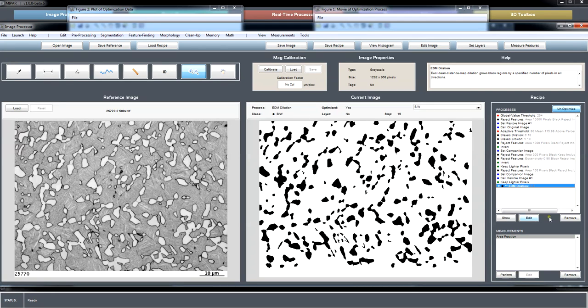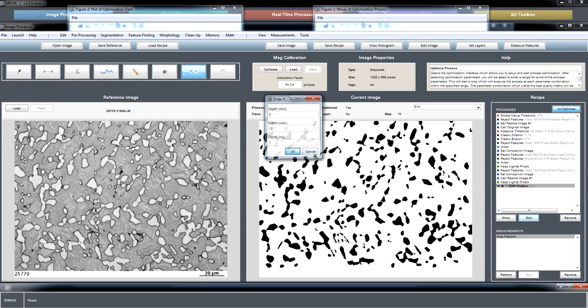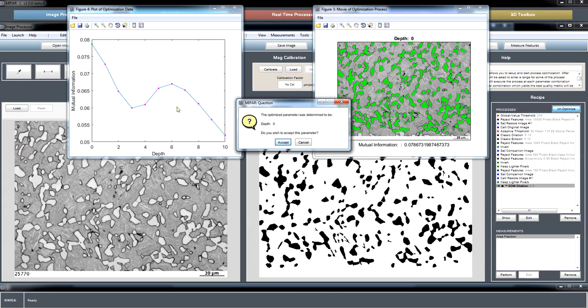So now we make sure that we're only dilating the features. Let's try that again. There we go. Nope.